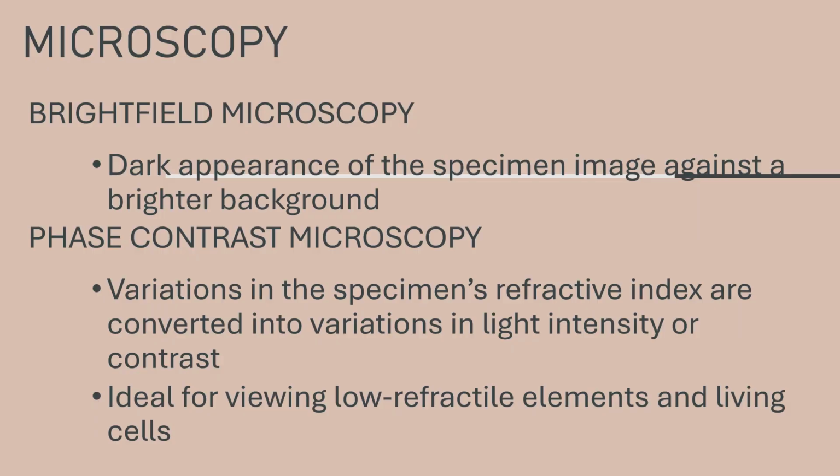Microscopy, again, that is your technique. All of the ones listed here are light microscopy accordingly, because they make use of visible light. Bright field microscopy has a dark image of the sample against a brighter background. And yes, this one is used for routine urine analysis.